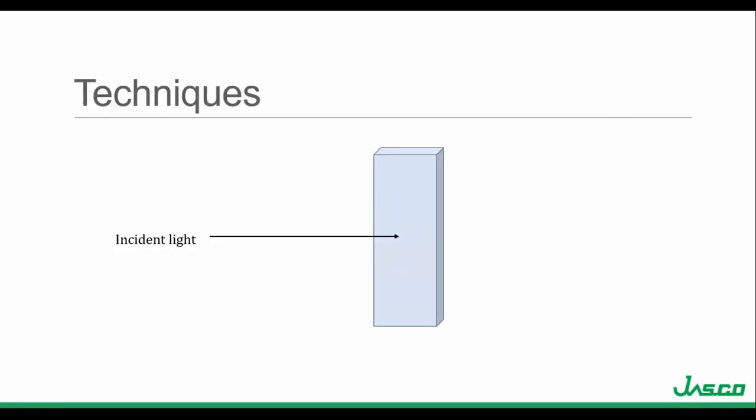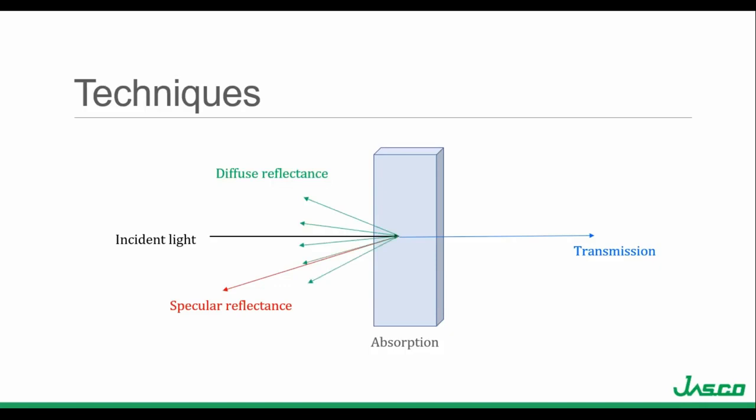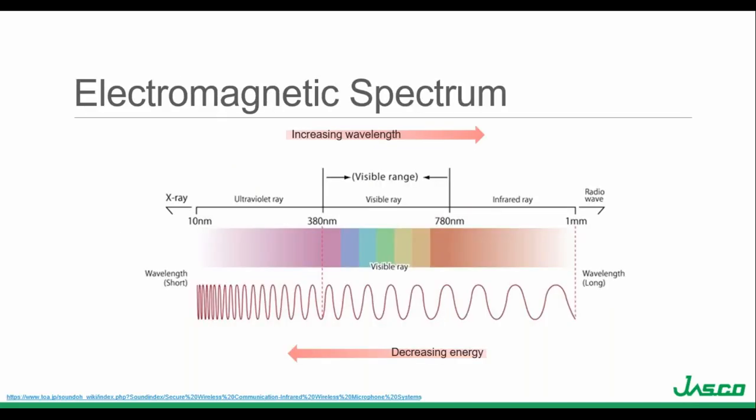When a substance is irradiated with electromagnetic waves, phenomena such as absorption, transmission, reflection, and scattering occur, and the spectrum produced reflects the interaction of waves of a certain wavelength with objects of a certain size, such as molecules. UV VIS near-infrared spectroscopy can be divided into the ultraviolet, visible, and near-infrared regions of the spectrum, depending on the wavelengths used.